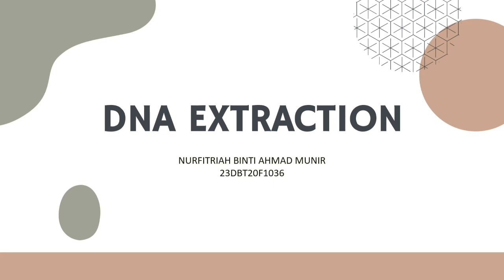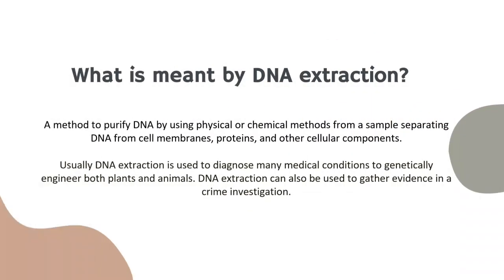Okay, today I want to explain about what is DNA extraction. So, what is meant by DNA extraction? DNA extraction is a method to purify DNA by using physical or chemical methods from a sample, separating DNA from cell membranes, proteins, and other cellular components. Usually, DNA extraction is used to diagnose many medical conditions and to genetically engineer both plants and animals. DNA extraction can also be used to gather evidence in a crime investigation.